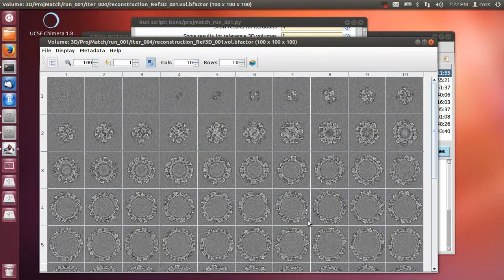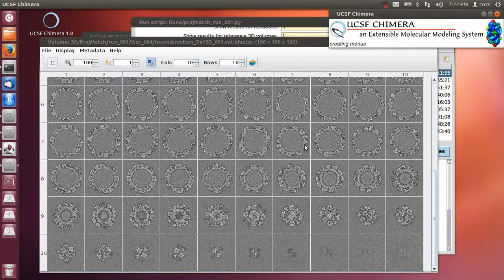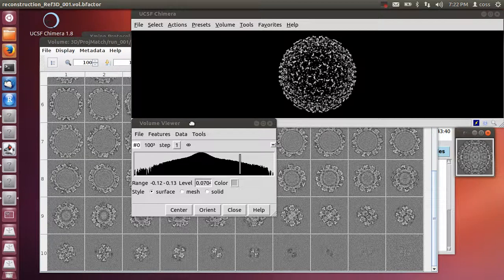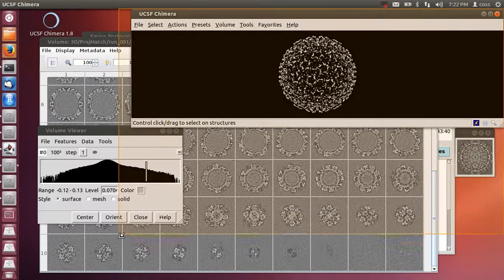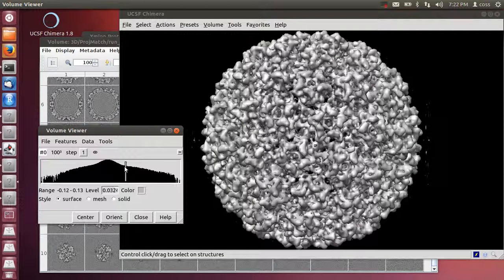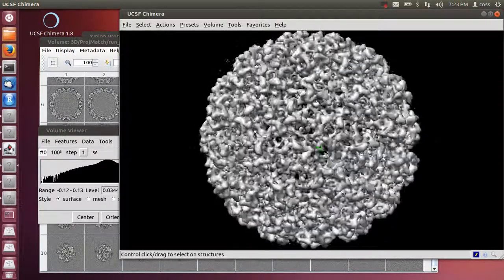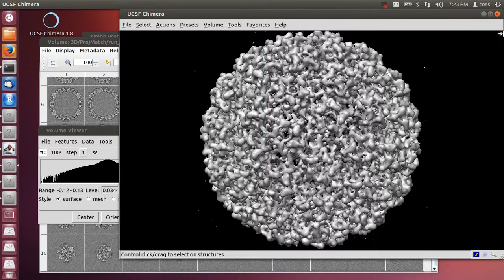So we have done here a fitting of how the linear plot looks like, and we have fitted it to a line and corrected by the slope of that line. So here we have enhanced the high frequency components, and you see more details. For this example where we have downsampled so much, it doesn't make sense, but in a real example where you have full information, it makes a lot of sense.